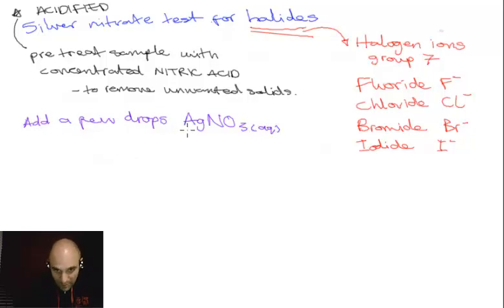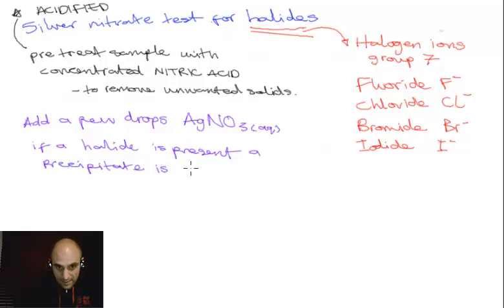And then what will happen is if a halide is present, you will get a precipitate. A precipitate is formed.